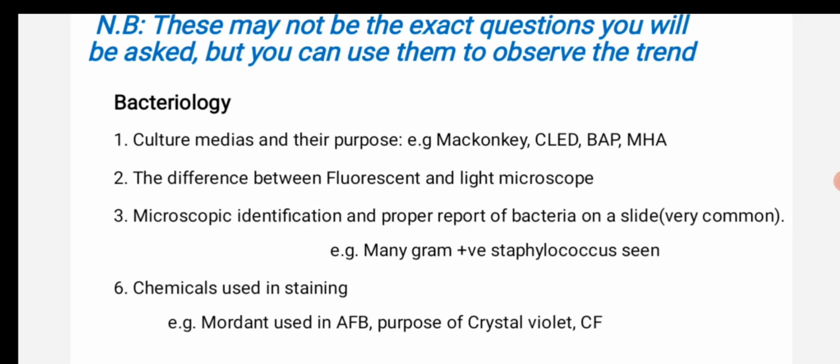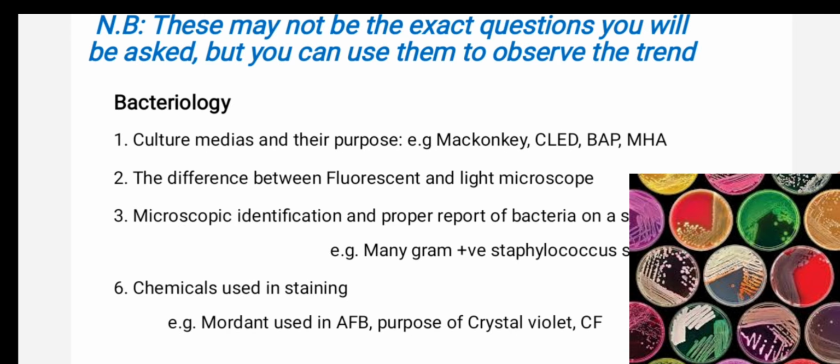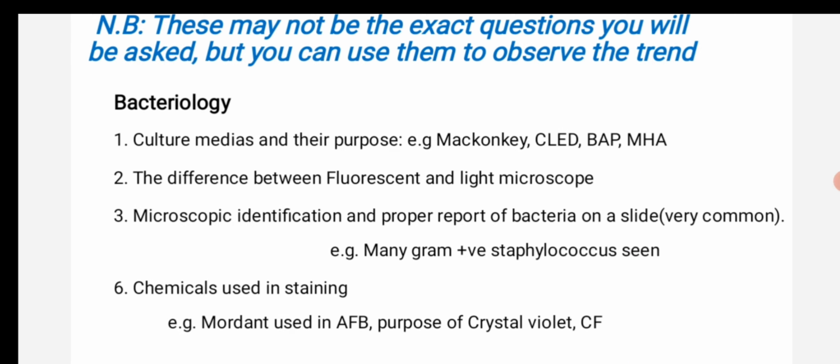MacConkey, what kind of media is it? What is the purpose of MacConkey? Blood agar plate, Mueller-Hinton agar. So we may be given the culture media. This is very common, you have to know this. We have to know at least the major culture media, what kind of contents are in MacConkey, in BAP, or in chocolate agar, and other media, and we have to identify their purpose and content.